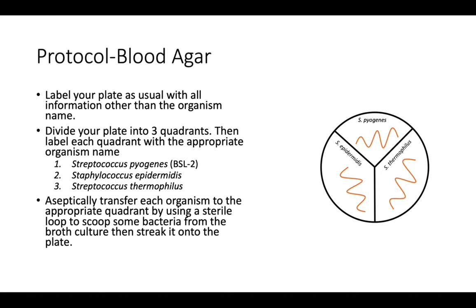And so that's it. That's all you need for your day 2 of selective media and your first differential plate. So remember, you've got EMB and blood agar, and that is all you're inoculating. So hopefully you'll be done fairly quickly. You can get out and spend your time studying.